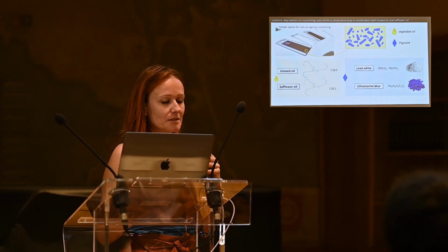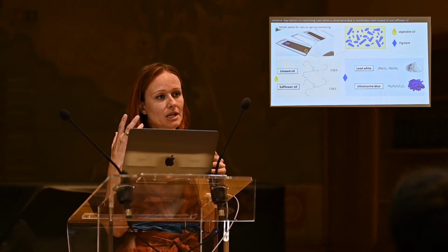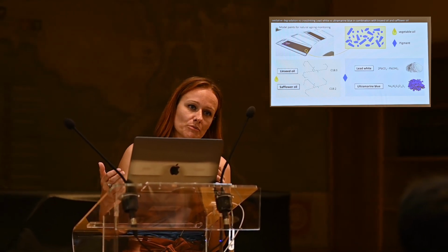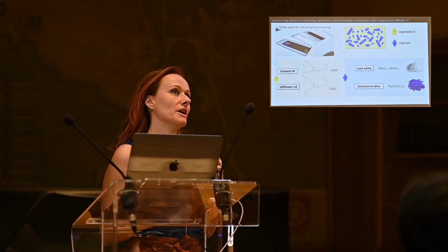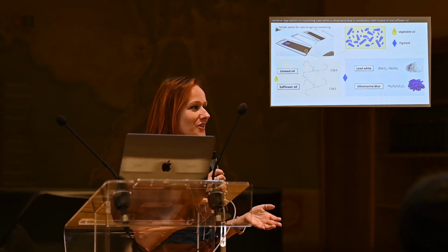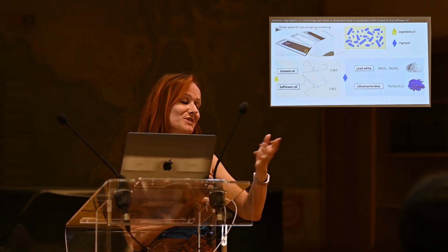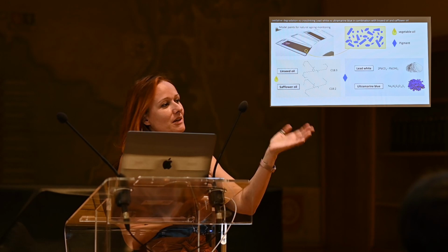We prepared our model systems. We studied safflower oil and linseed oil, which has been discussed already today. Safflower oil is rich in doubly unsaturated fatty acids, while linseed oil is rich in triply unsaturated fatty acids. We chose two pigments: ultramarine blue, because it seems to push oxidation, and lead white. The choice of lead white was driven by the fact that we couldn't think of any pigment that is absolutely inert, so we said, okay, let's find something that we know something about. Lead white was an interesting candidate because it leads to a stable paint layer, at least in terms of water sensitivity. Metal soap is another problem, but we also know that it's a catalyzer. And so we compared these systems.